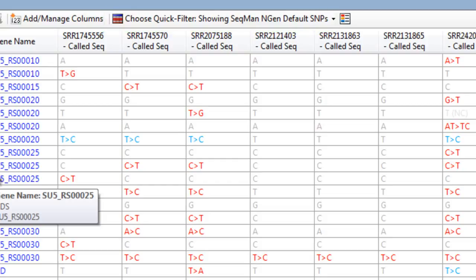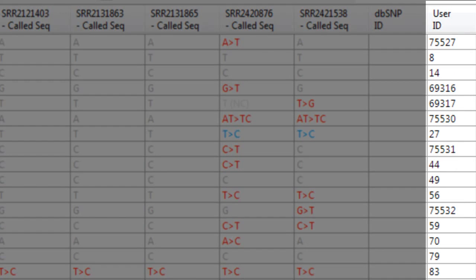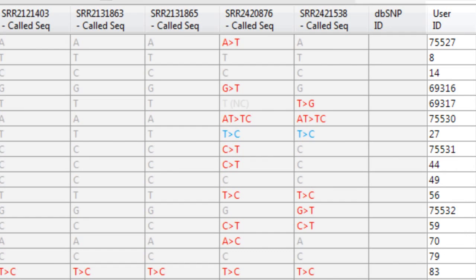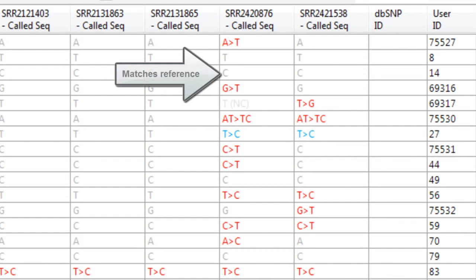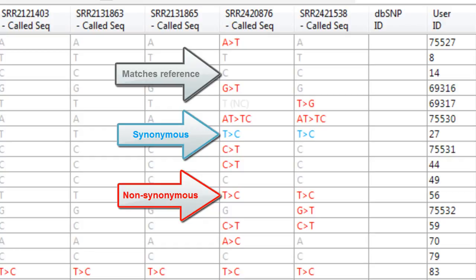Note that each SNP row shows the user ID from the VCF file, and at each position, you can see which strains match the reference genome, and which strains have synonymous or non-synonymous SNPs.